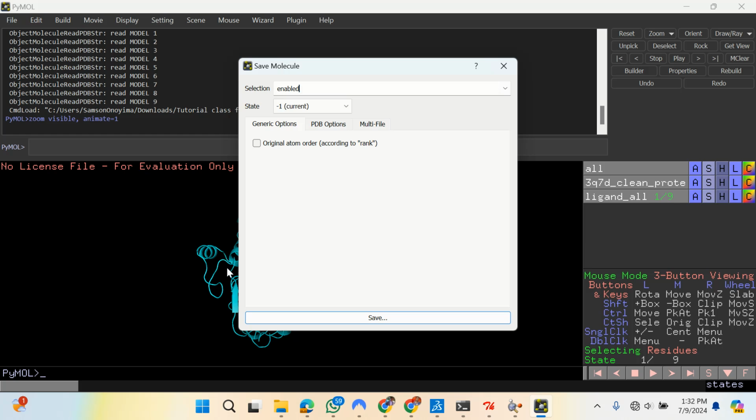You can use this tool to cause intentional mutation. I might decide to remove that one, 120, and put valine there and check the effect of valine with respect to that particular condition. Assuming there is a particular disease condition that a mutation in that particular amino acid predisposes the individual to. Example is sickle cell, where a change in amino acid or mutation in amino acid predisposes the individual to sickling of the cell.